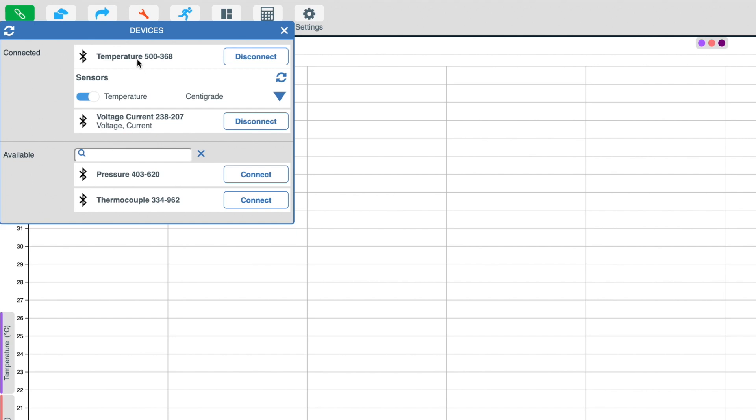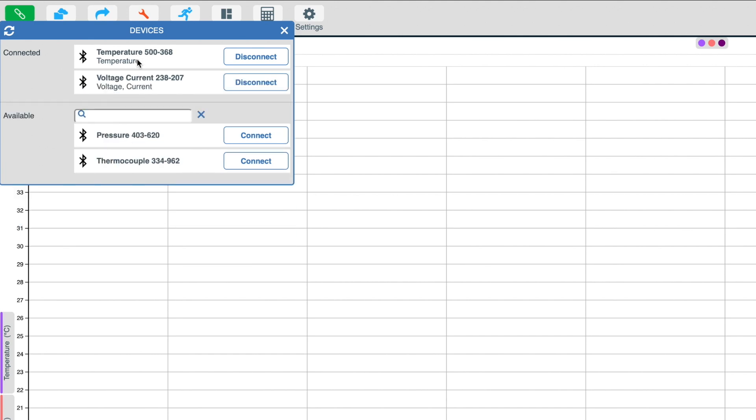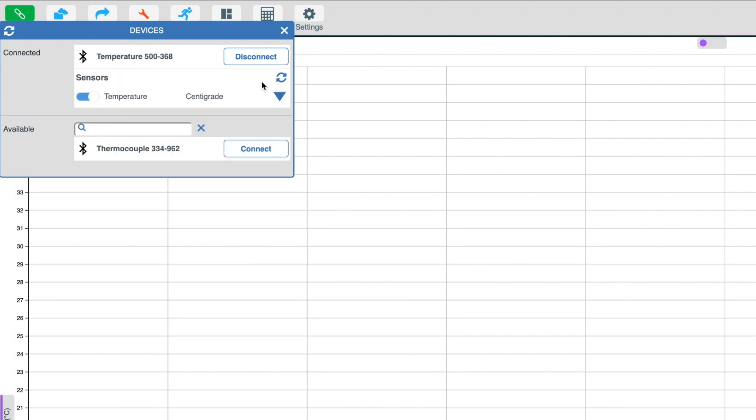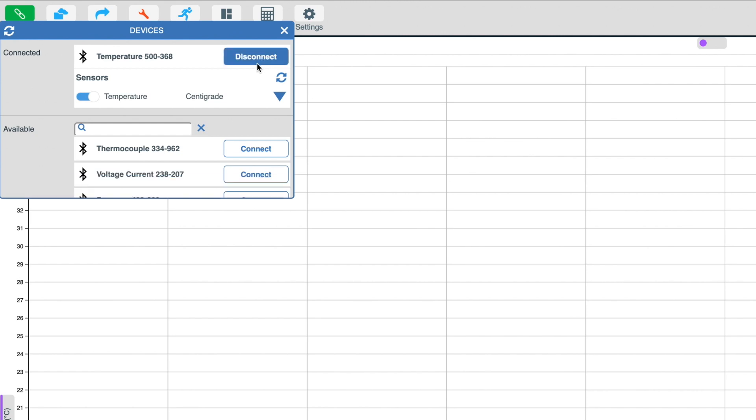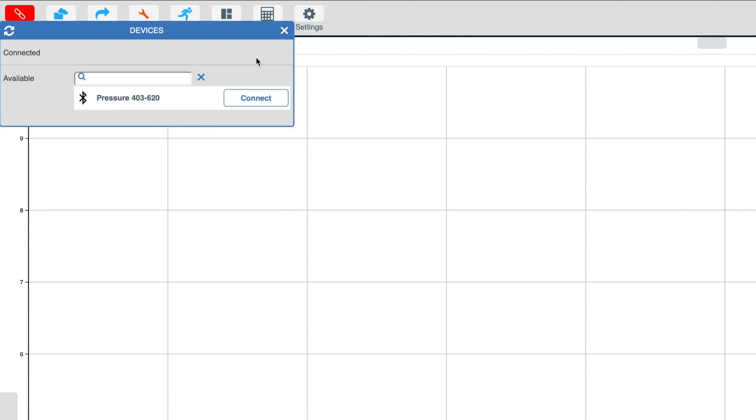To disconnect a sensor, simply click on the disconnect button. Now that sensor will return to the pool of available devices.